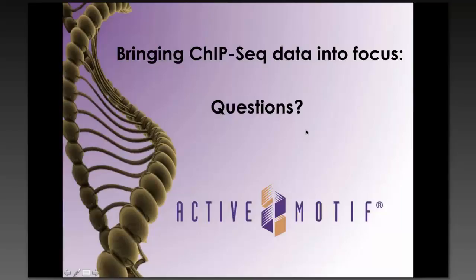Another compliment. Can you actually apply the same approach for low-signal ChIP-Seq? Yes, I think from what we see, the better the antibody that's targeting the human, the less spike in it comes out. So that means the opposite is the worse your antibody is against humans. So let's say the mark you're targeting, the antibody is not good or it's present at low levels, the more spike in tags that you'll get. So I think it's important that you don't overwhelm your system with spike-in, and I think there's going to be some variation on how much spike-in to use depending on what antibody you're using. But in theory, the answer is yes, it could work in any ChIP reaction.